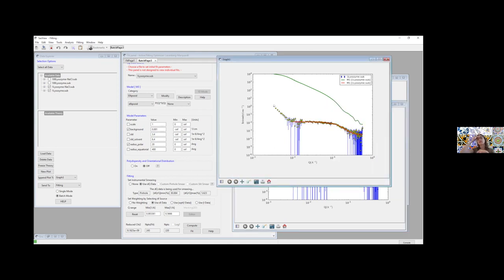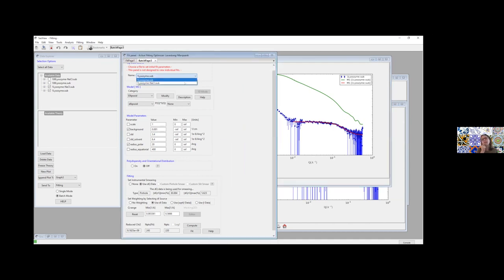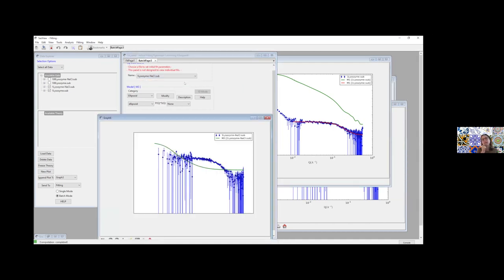So it's not showing you the other data because the one lysozyme is the one you're using as a reference, right? It's just showing you the chi-square for that one, but it's showing you the line for the other data. Oh, okay. Yeah. Oh, thanks.